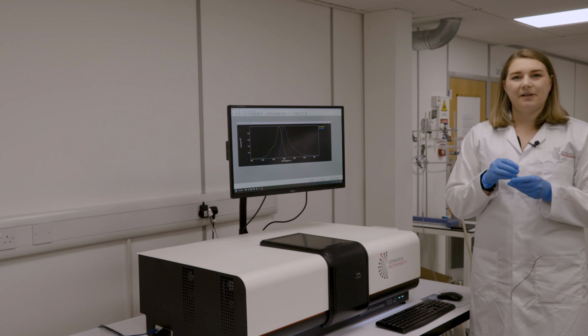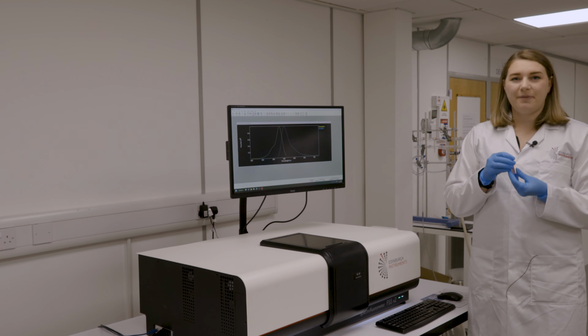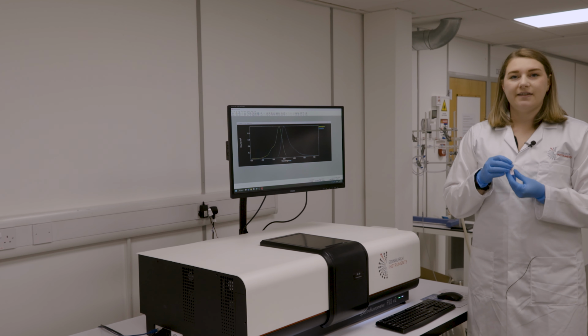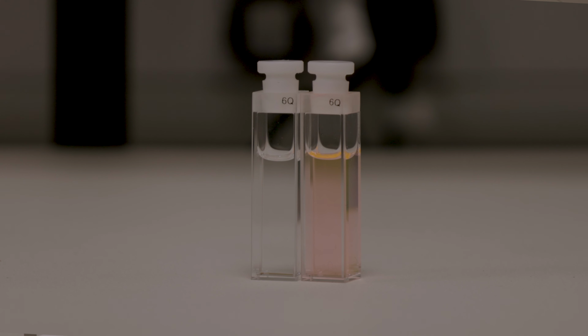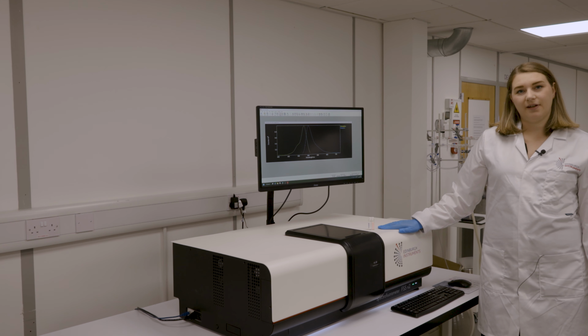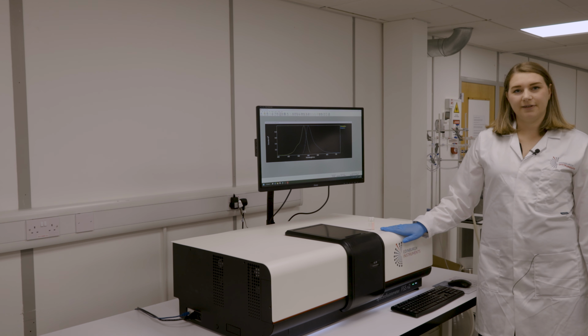Before we perform quantum yield measurements, we must know the absorption and emission properties of our samples. This is so we can select the correct excitation wavelength. For this demo, the sample I'm using is rhodamine 6G in ethanol. That means that the blank is also ethanol.